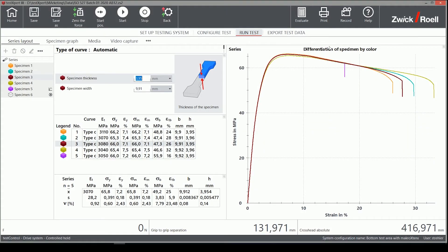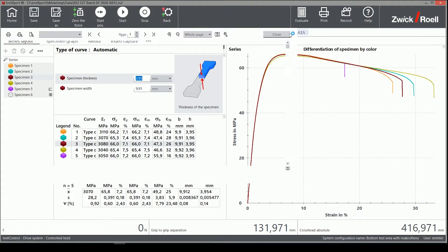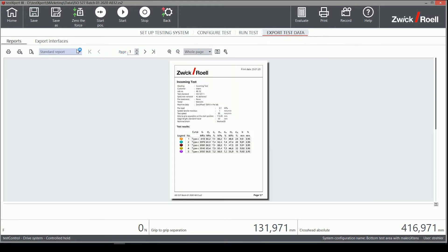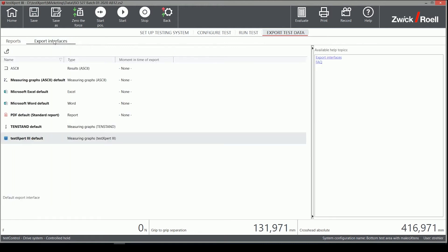Then, I quickly prepare a PDF test report for our customer and internal documentation. These two exports can be done fully automatically. However, I have done it manually since we do not need these documents every time.